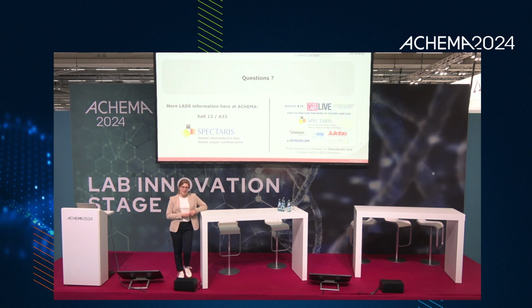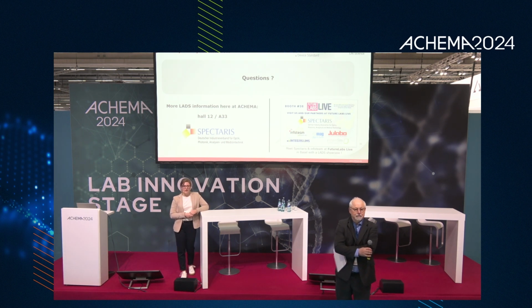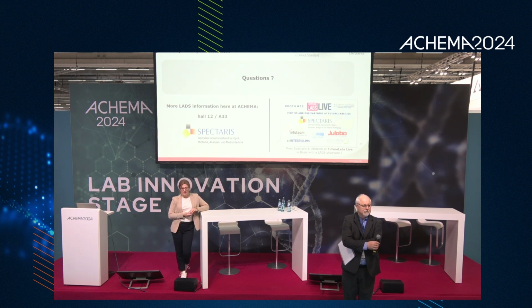So, yeah, it's possible. We actually do this also at infoteam. If you have old devices, you could also get an extra LADS interface for your old devices, which is specially customized for you, and then you can also use LADS.